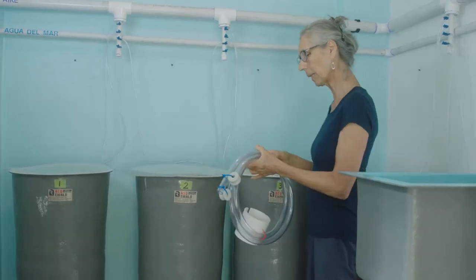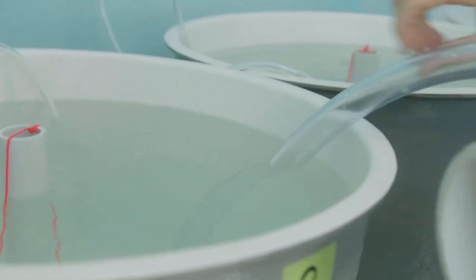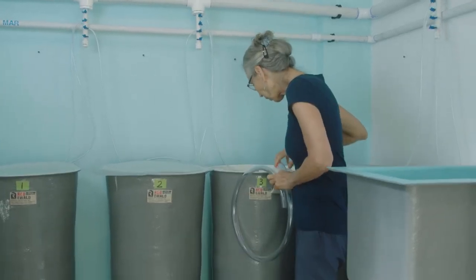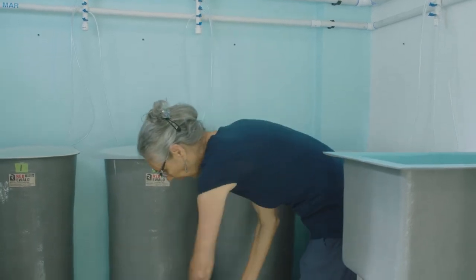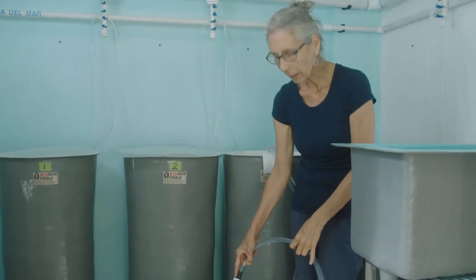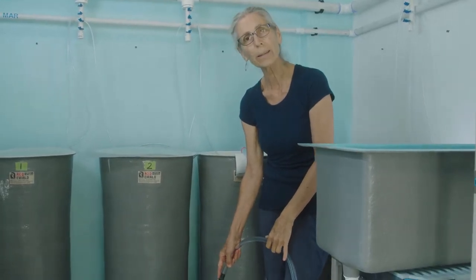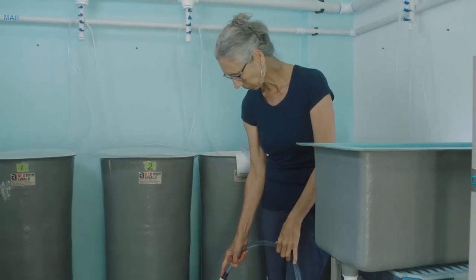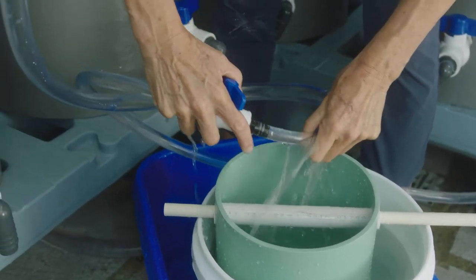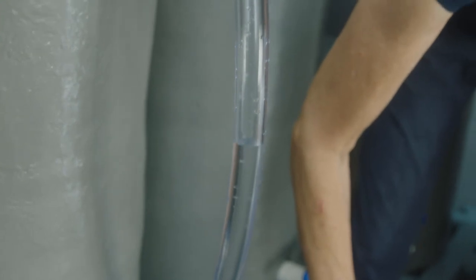We take the larval tank lid off, here's our siphon hose. We put it inside the tank first and clip it onto the side. One thing to be careful about is not to put your hands in the tank as much as possible — we try to do everything as clean as possible. The siphon hose gets hooked into the handle. It's important to fill this bucket up at least three-quarters full so the veligers go directly into water when the siphon starts. We start the siphon by filling the hose with water — and there we go.